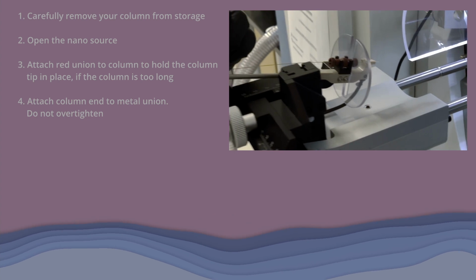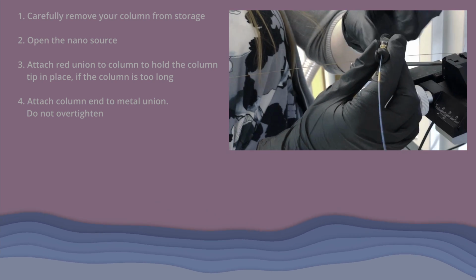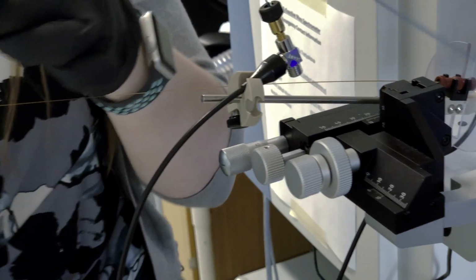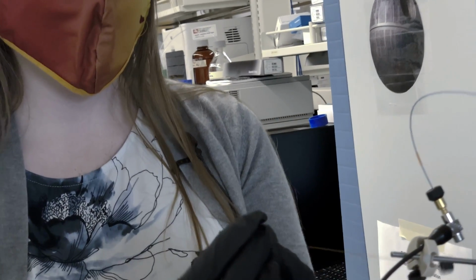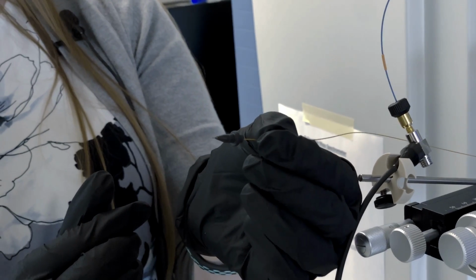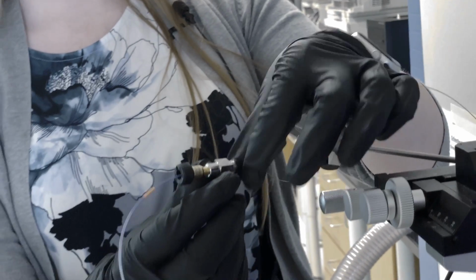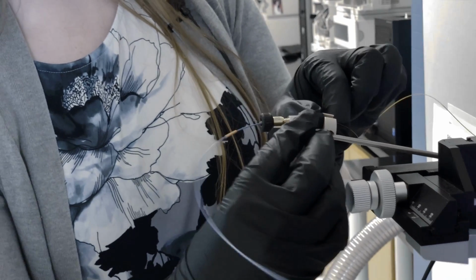To attach the end of the column to the lines that have the source of solvent flow, we remove this ferrule and insert it through the end of your column. So here you want the end of your column just barely sticking outside of this. Then you'll reattach it to this union. And place it here.